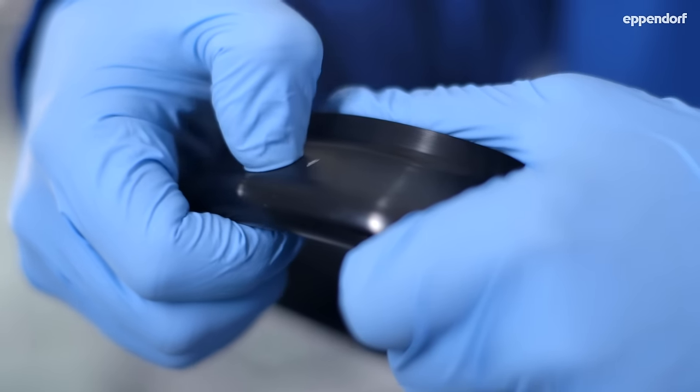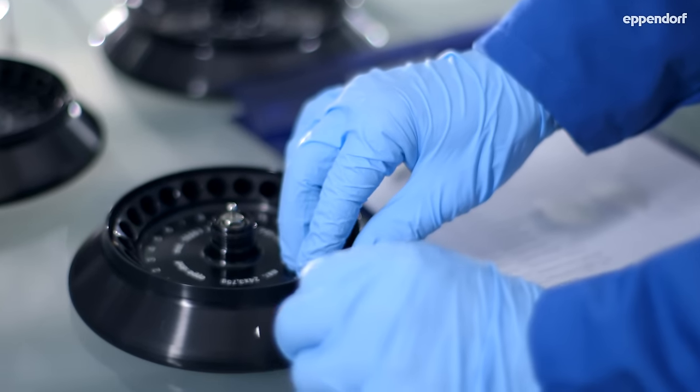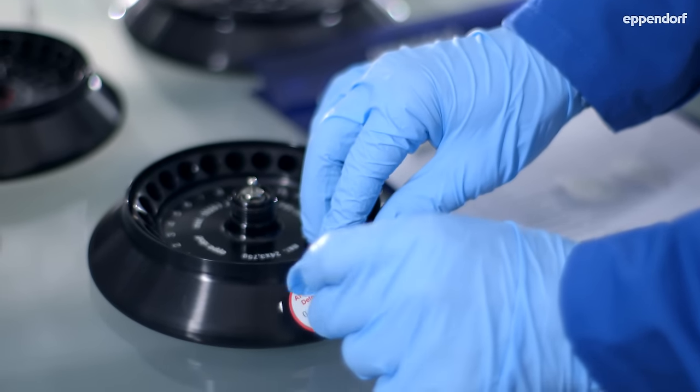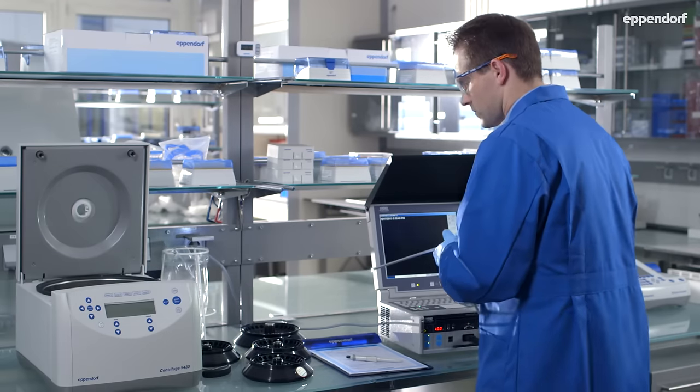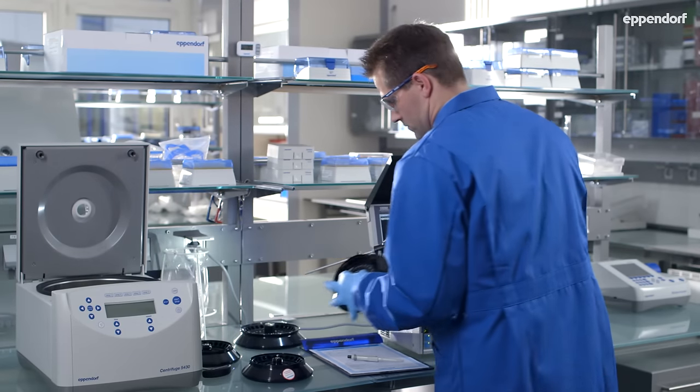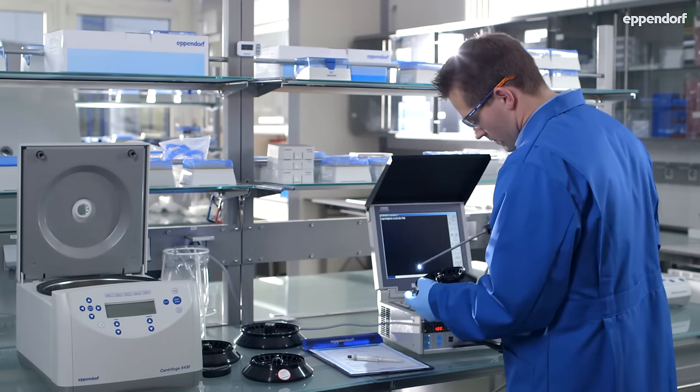Eppendorf rotor assurance plans offer professional inspection and evaluation services for Eppendorf rotors. Our certified and specially trained service technicians use highly sophisticated bore scope equipment for inspections.